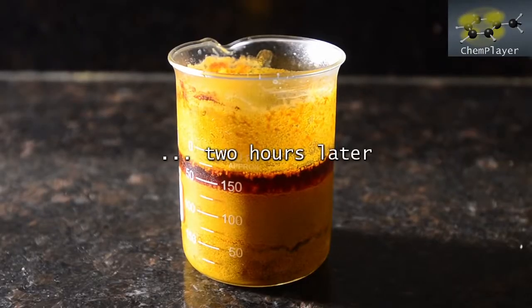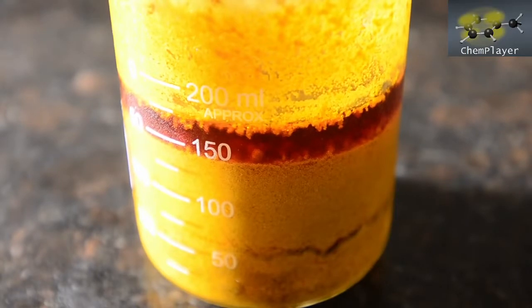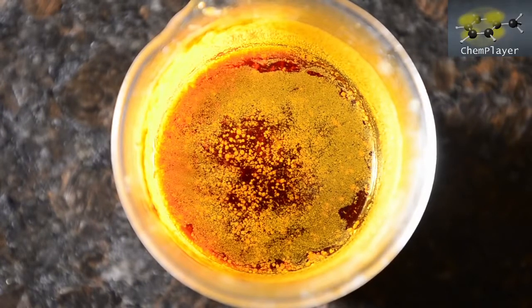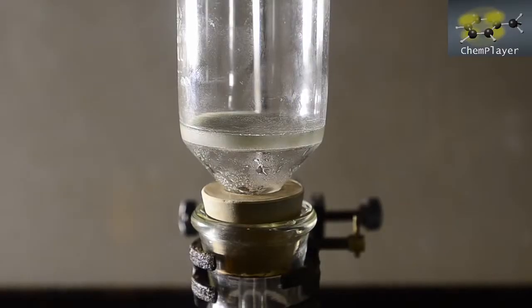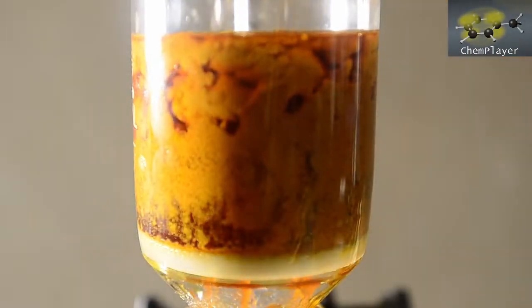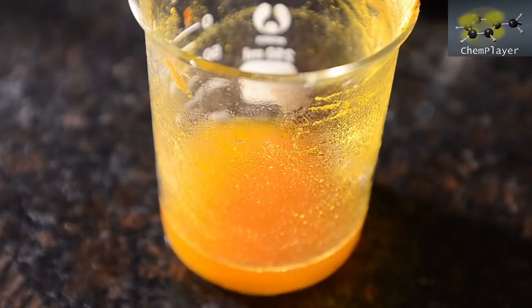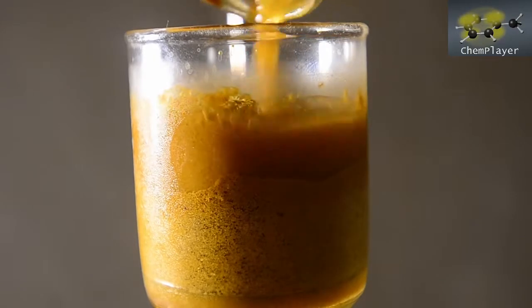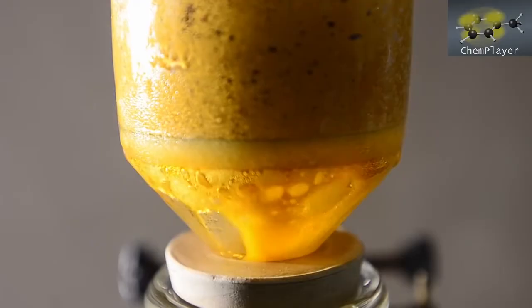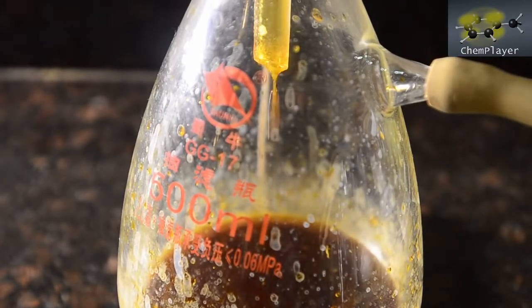Here we go after 2 hours of chilling down. Quite a bit more precipitate has formed in the bottom DCM layer now, so we're going to filter this now and see what we've got. We wash the beaker out with cold water, and then wash the yellow solids carefully with cold water until the filtrate was only a pale yellow color.